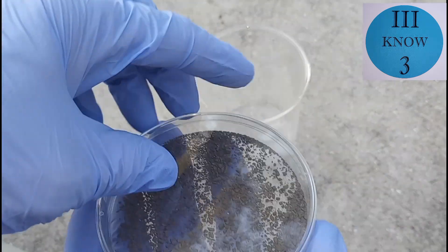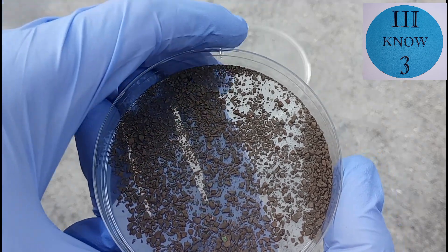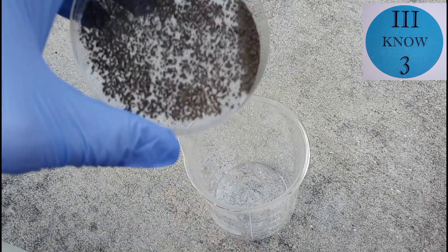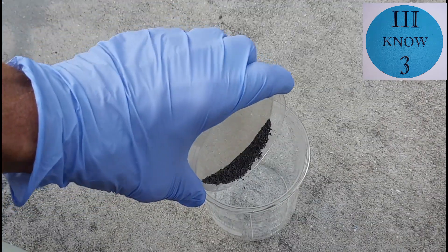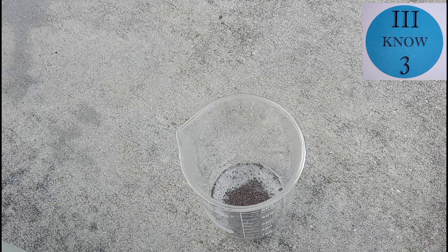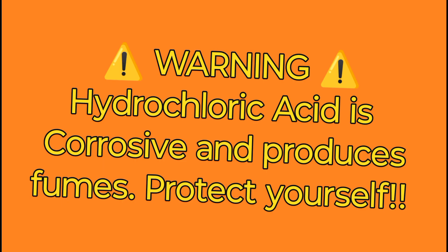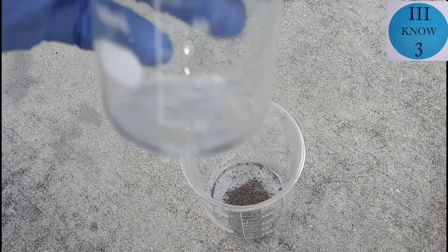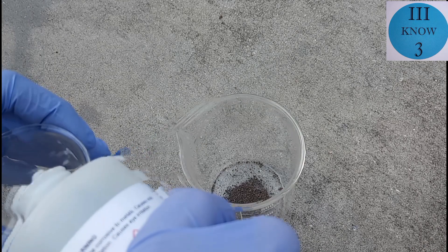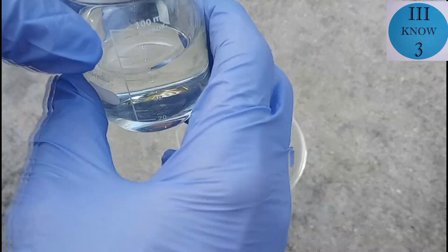These are brass pieces leftover from the brass, copper, zinc, and acid series. They were everything that didn't get dissolved, so we're going to try to dissolve them in hydrochloric acid. Be careful with hydrochloric acid. We're going to start off with about 50 milliliters of 2 molar technical grade hydrochloric acid.